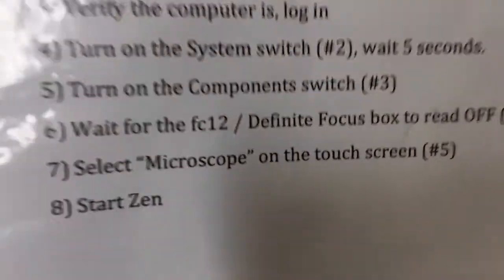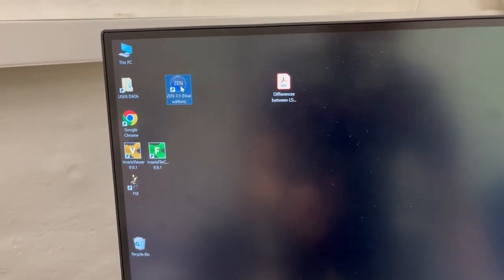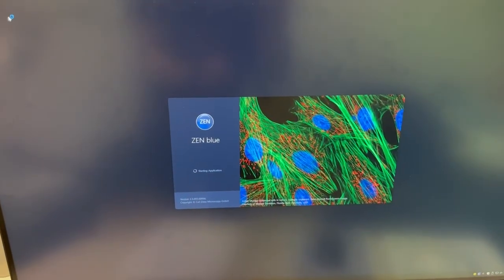The final step for startup is to start Zen. The icon for Zen is in the top left — Zen Blue. You double click on that and the software will load. That completes the startup procedure.